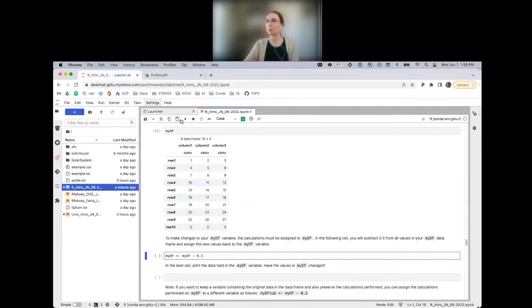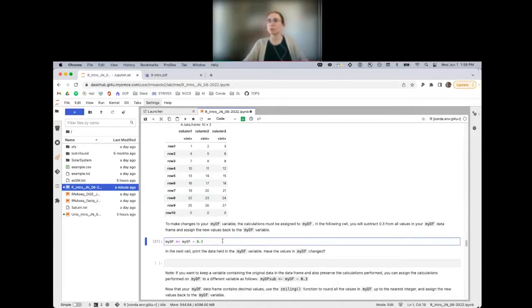But in the meantime, let's go ahead and run this pre-populated cell. As you can see, when I ran this cell, there was no output. That's because when you assign something to a variable, it doesn't get printed out to your output, it gets stuck back into that variable. So unless there's an error, you shouldn't see an output when you're assigning something to a variable. So this is a good sign. If anyone got an error or a different output, please let me know.